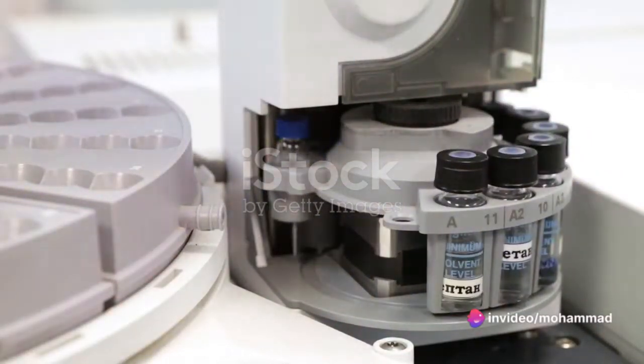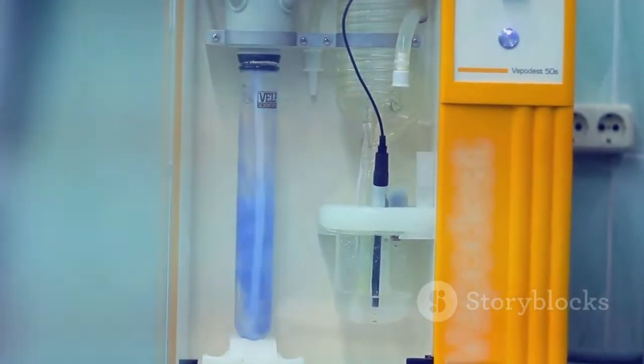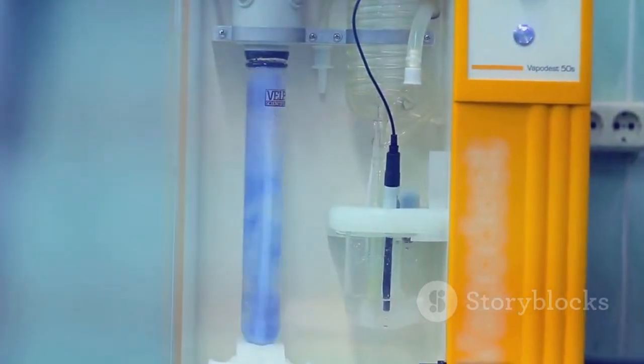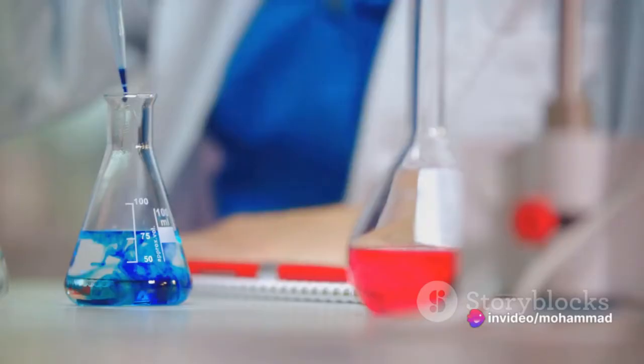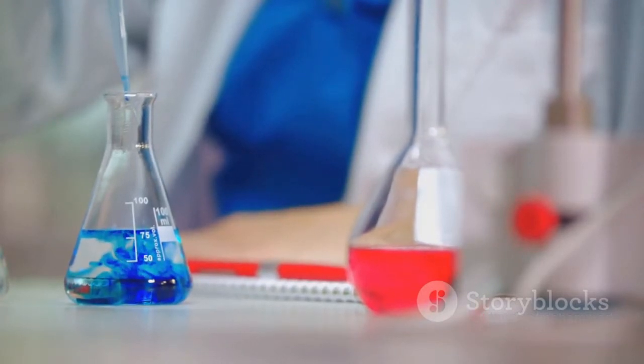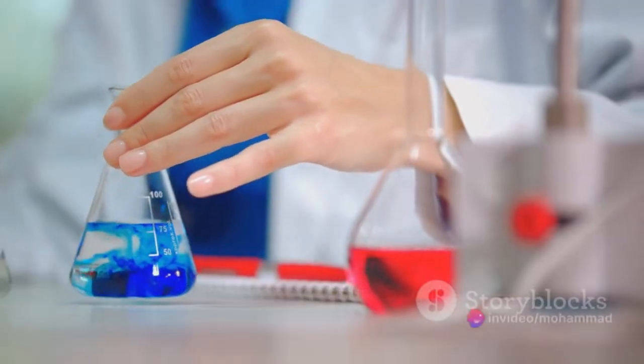Gas chromatography is a common type of chromatography used in analytical chemistry for separating and analyzing compounds that can be vaporized without decomposition. It plays a crucial role in testing the purity of substances, separating components of a mixture, and identifying compounds. In essence, gas chromatography is the science of separating the invisible.